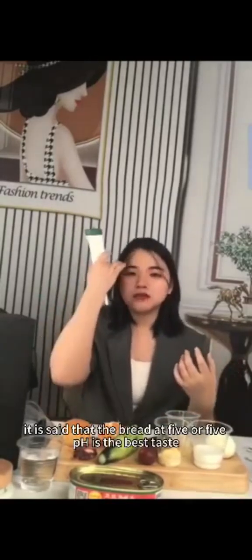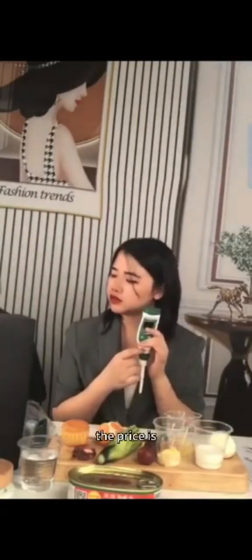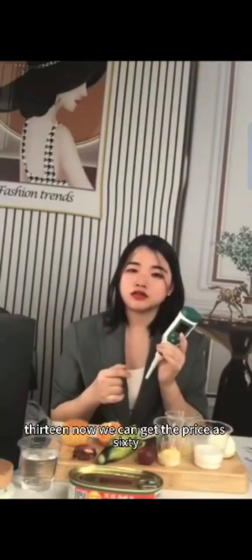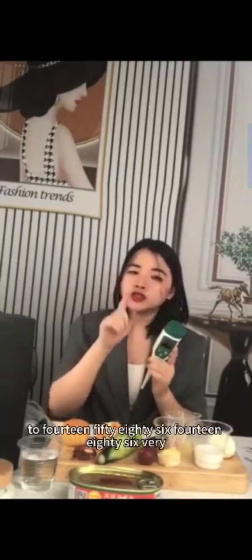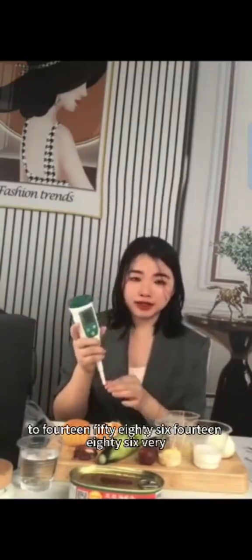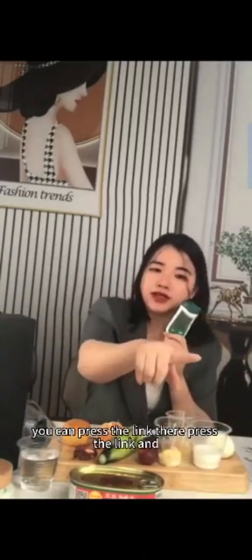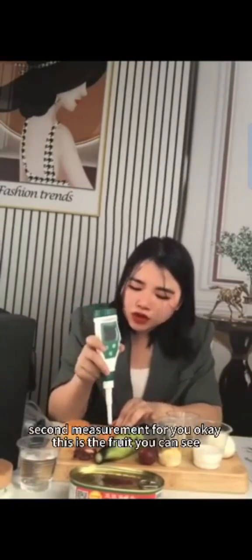It is said that bread at 5.5 pH has the best taste. You can buy our pH meter — the original price is 17.30, now you can get it for 14.86, a very big discount. If you feel moved, press the link and you will get the best price. Now let me do the next measurement — this is a fruit.